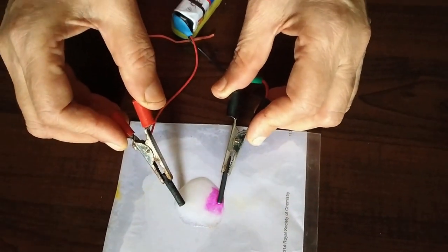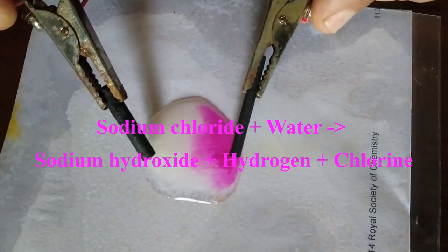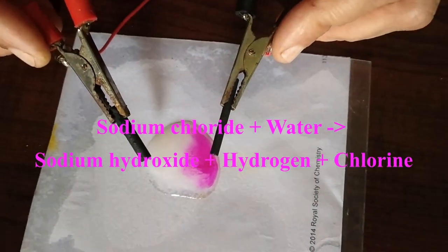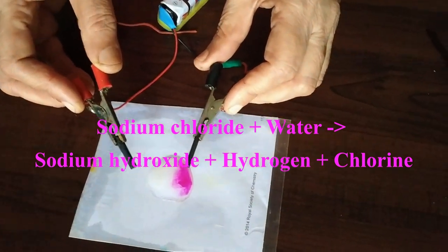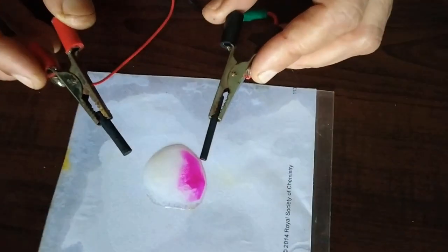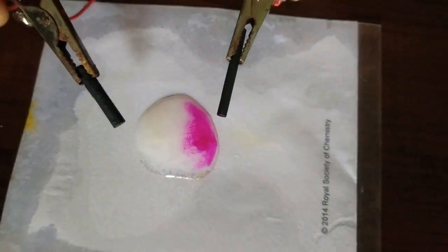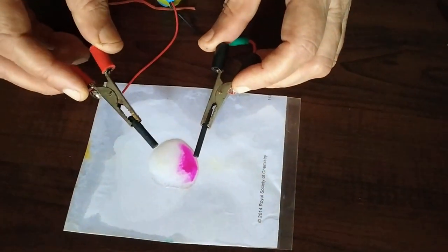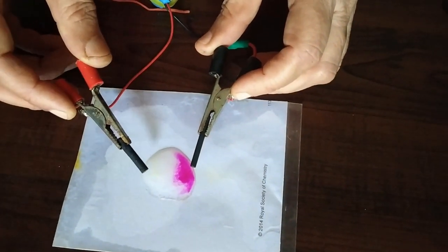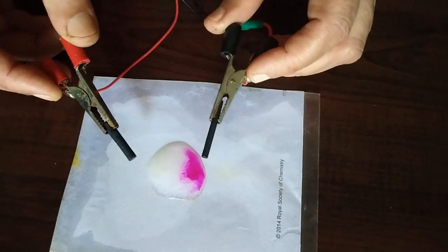You can just see the pink color appearing on negative electrode because sodium chloride decomposes into sodium and chloride, and sodium ions are moving towards negatively charged electrode, right? And if you just leave it for some more time, you will even see hydrogen being released at negative electrode, that is cathode, and chlorine released at the other electrode, positive electrode, right?